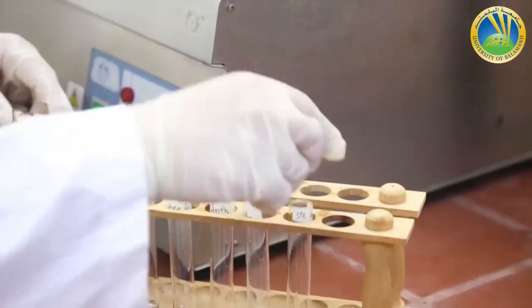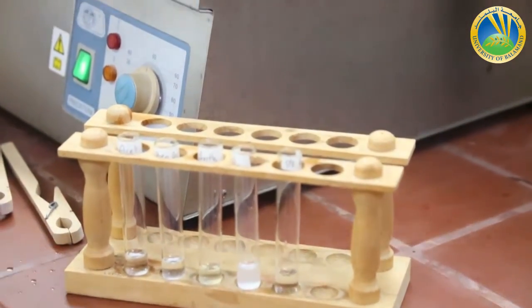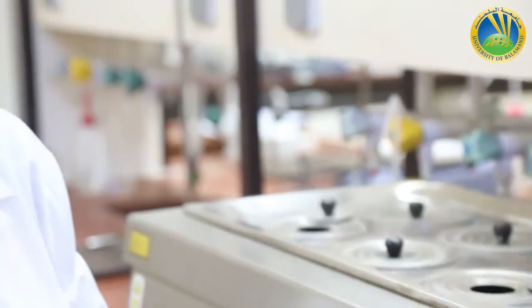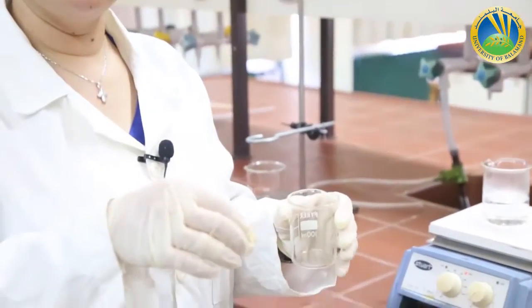We are going to move to the next part of our experiment, which is the recrystallization of acetanilide. Now after those tests, I can choose an adequate solvent to recrystallize acetanilide, and I will choose water. This is the second part of our experiment. We weighed 1 gram of acetanilide.